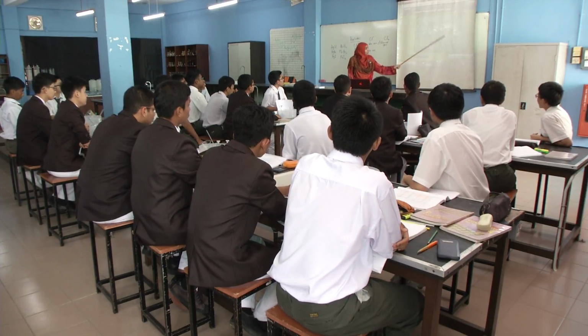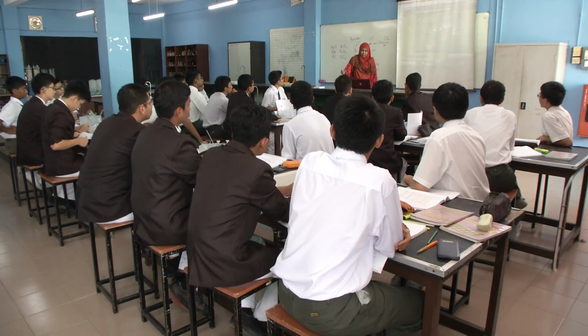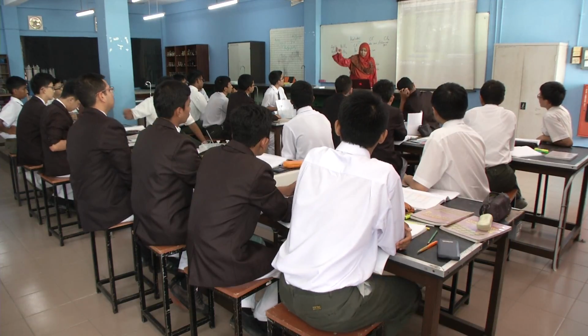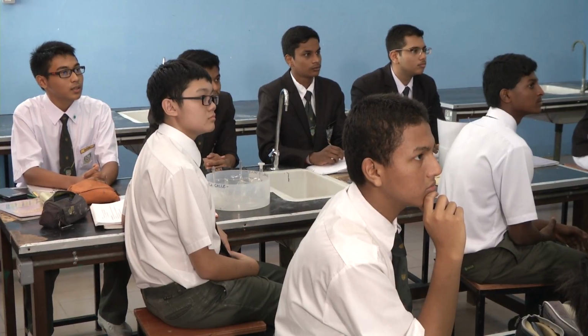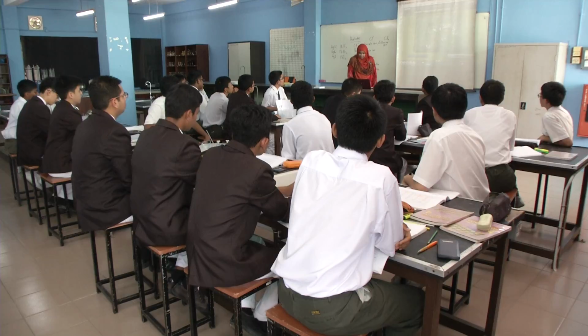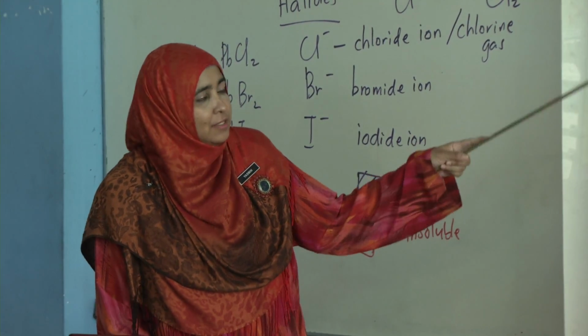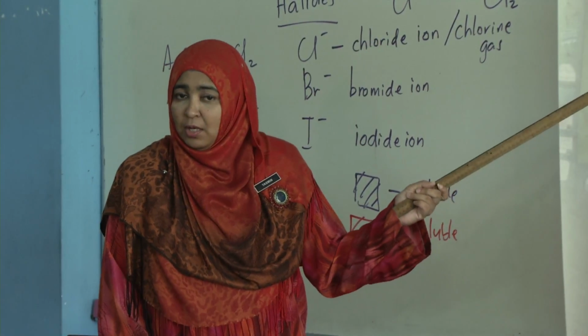Okay, so this is a very easy experiment. You just need to pour. Yours you are getting in a volumetric flask. So you just pour one salt solution into the beaker and then followed by the other salt solution. So it will be something like this. Okay, the moment you have poured the second solution, you will get a precipitate.